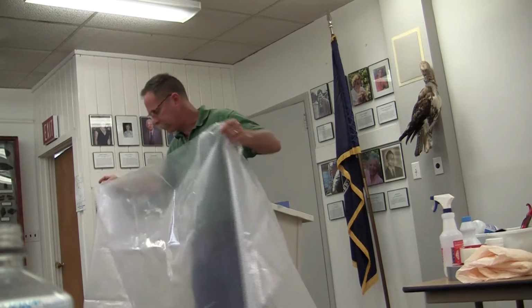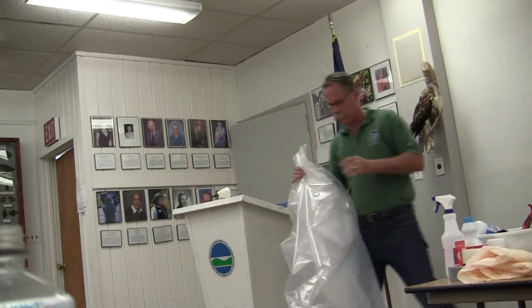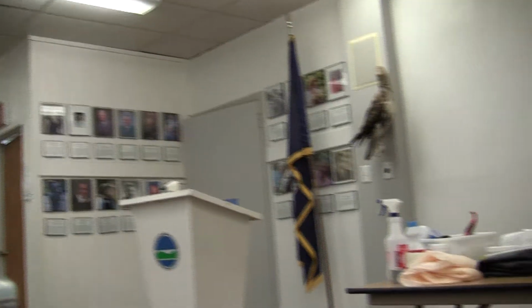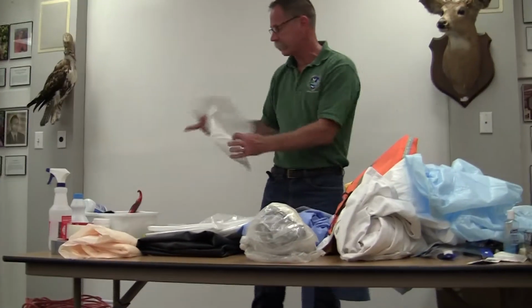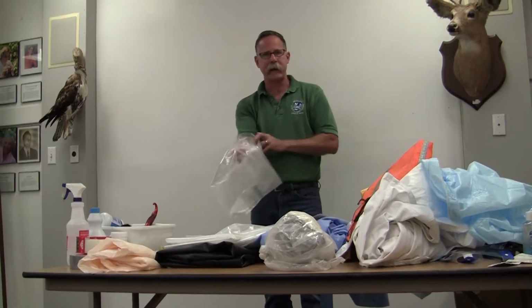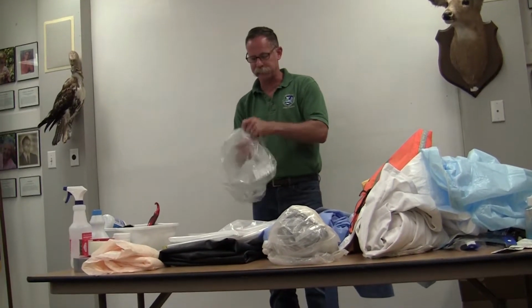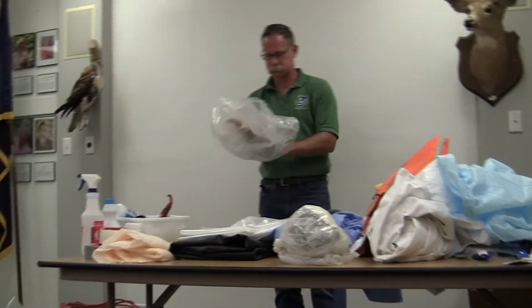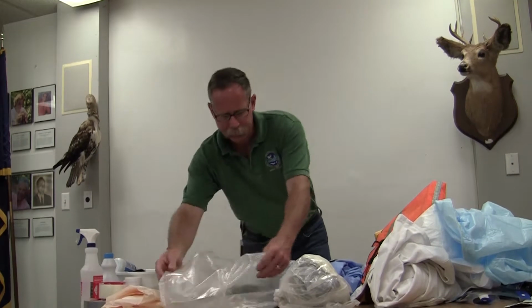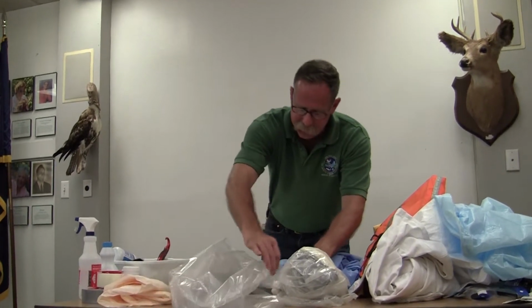And actually, I'll demonstrate on a smaller scale the best way to do that. Let's pretend this is your dead deer, and we're going to pretend that this is that giant bag. What you want to do is take the bag and fold it back on itself to half its length, and you lay that down with the folded edge next to the deer carcass.